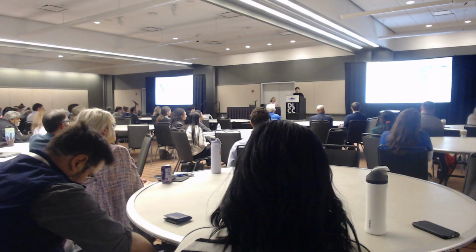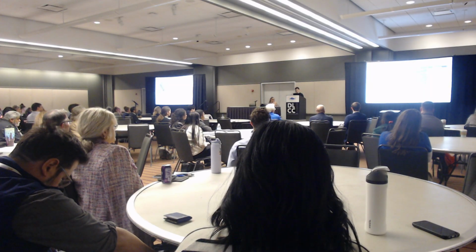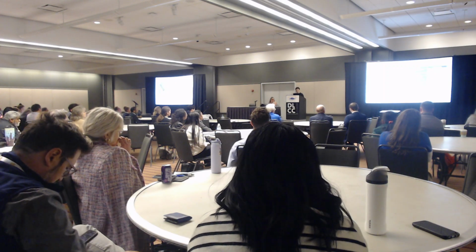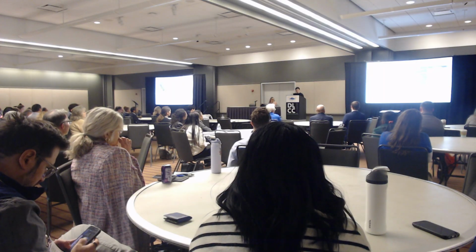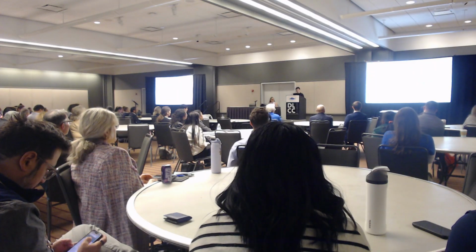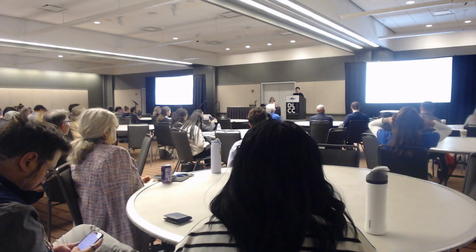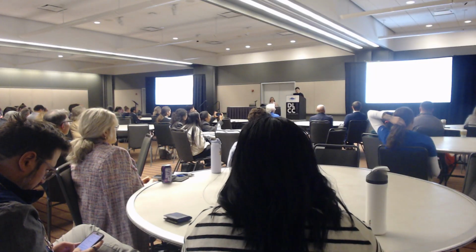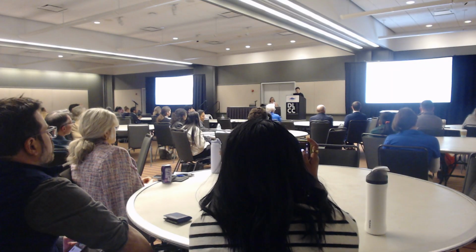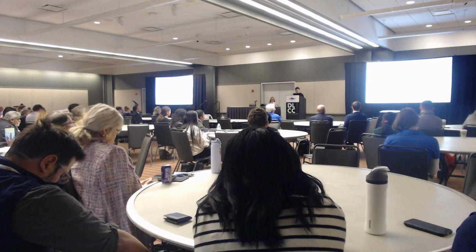So up to now, all the spatial technologies we developed are only compatible with fresh frozen samples, which is a huge limitation because clinically, most of the samples are stored as FFPE samples. So to address this challenge, we recently developed a new technology called spatial FFPE ATAC, which is compatible with FFPE samples to look at the chromatin accessibility. So we did extensive optimization of the protocol.